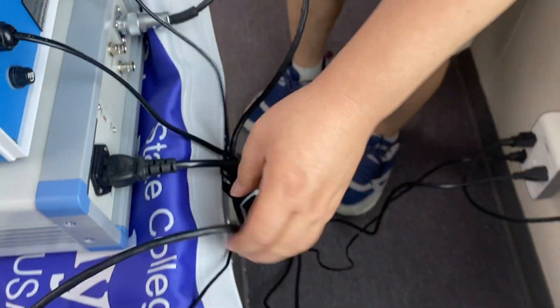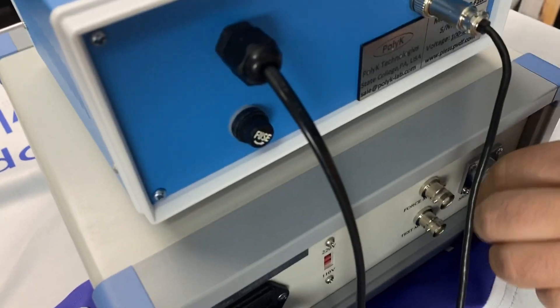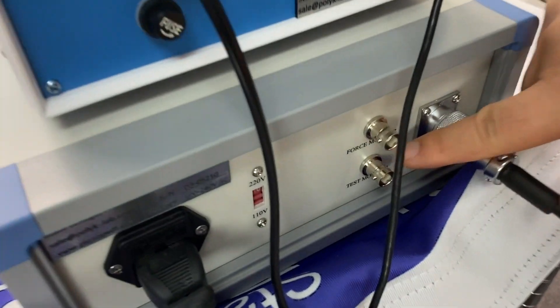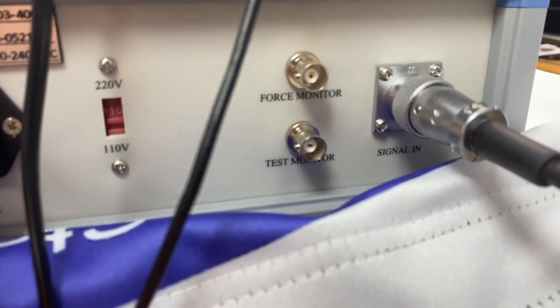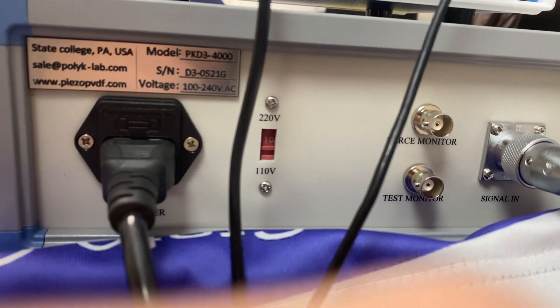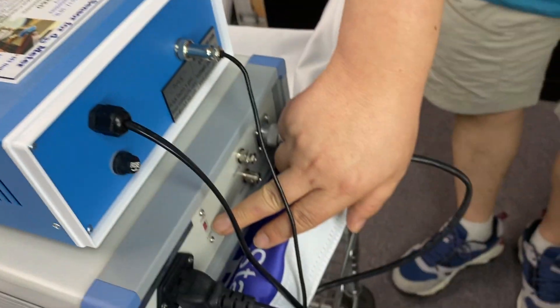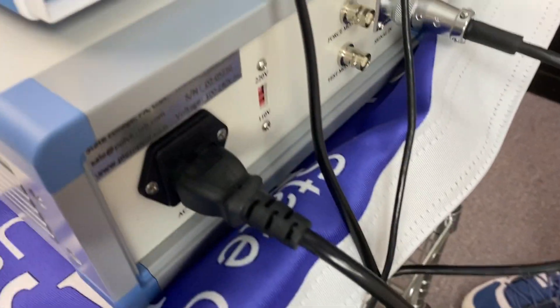There is only one delta cable connected to the back of the D33 meter and to the shaker — you cannot make a mistake. This one is just a power cable. And these two are the force output and the D33 output, which you can connect to a multimeter or oscilloscope to check the value if you want to control it by computer or some external device. This unit can also be used at either 110 volts or 220 volts, switchable very easily.